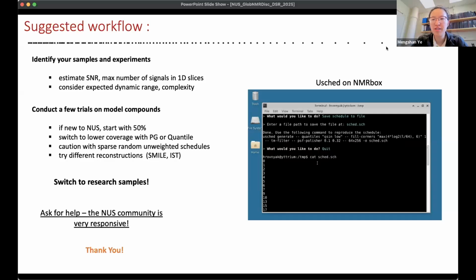Thank you so much. And then correspondingly, we know that if we know the noise level of the data, there's a time at which the remaining artifacts during, say, an IST reconstruction get as small as the thermal noise in the data. So that's what tells us how to stop the iterations, that we've described enough of the experimental data.